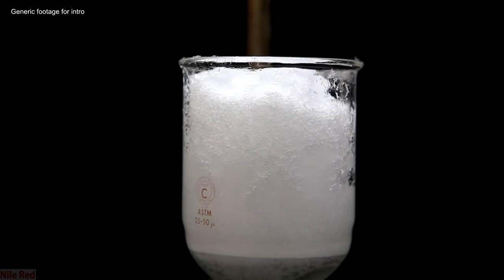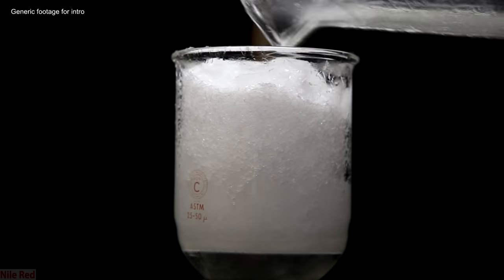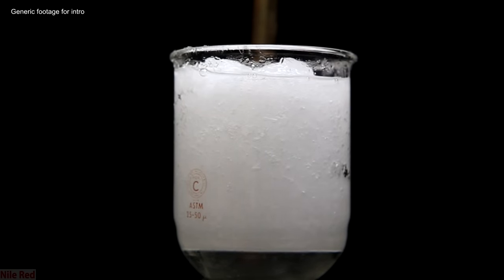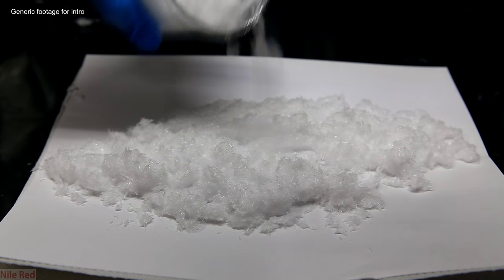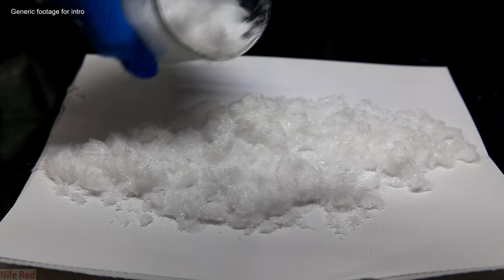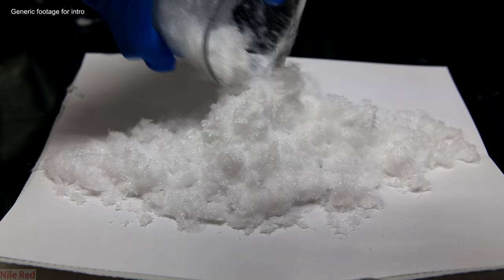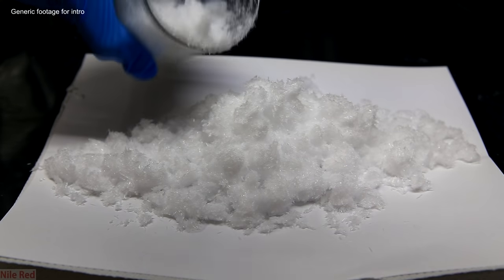Chromatography isn't one technique and it's a huge array of techniques which are based on the same principle. In all chromatography, we have what's known as a mobile phase and a stationary phase. Our products move with the mobile phase and they pass over the stationary phase. Even products that have very similar solubilities will have different molecular properties.